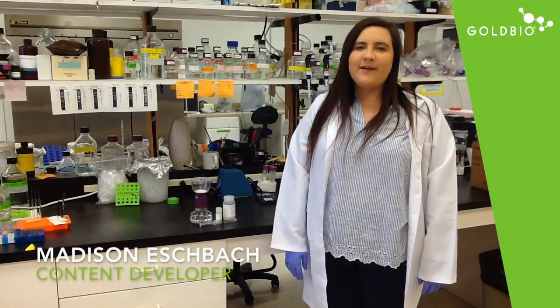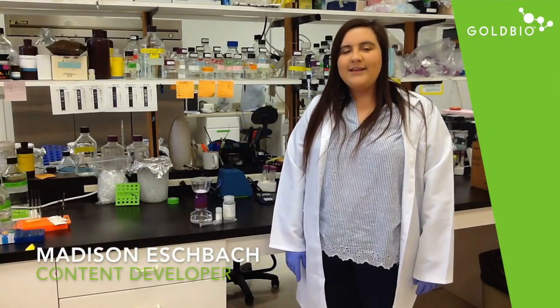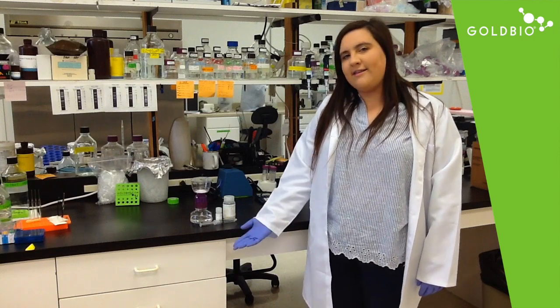Hi guys, it's Madison and I'm the content developer here at Gold Biotechnology. Today I'm going to be demonstrating how to make a sterile antibiotic stock solution using our antibiotic easy packs.